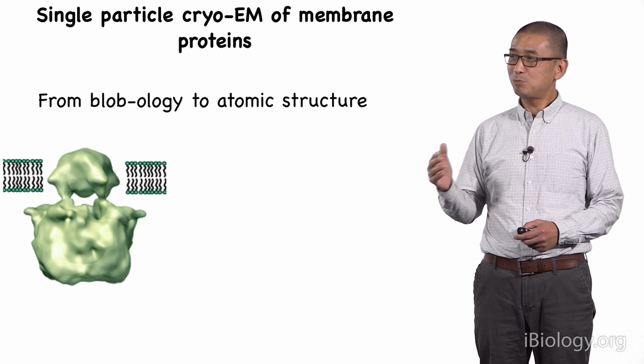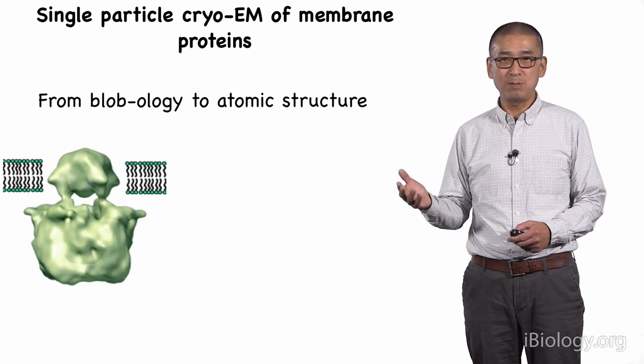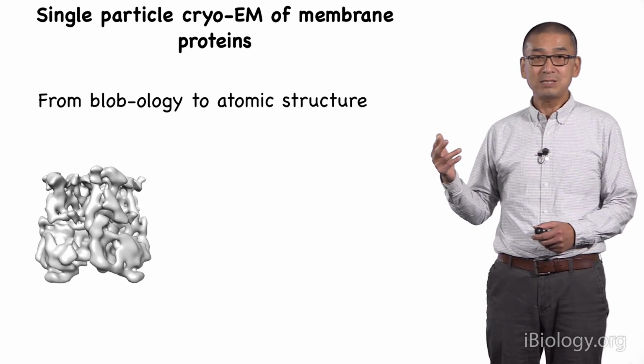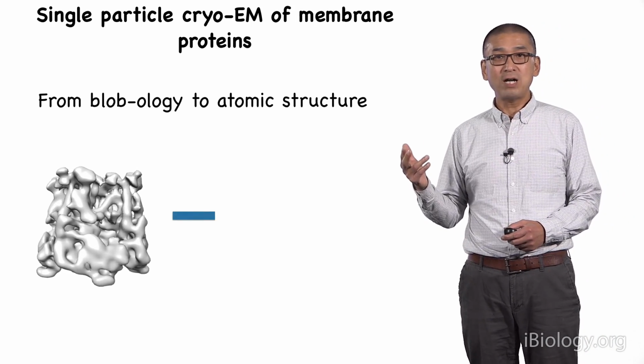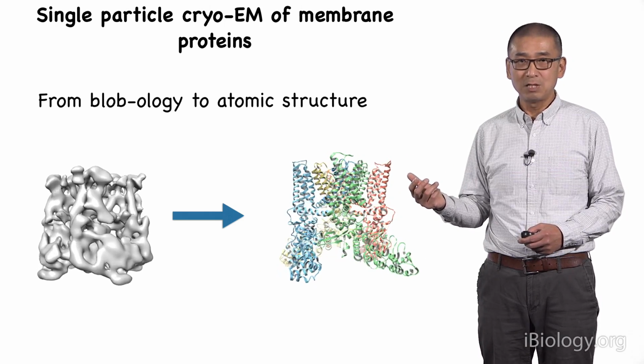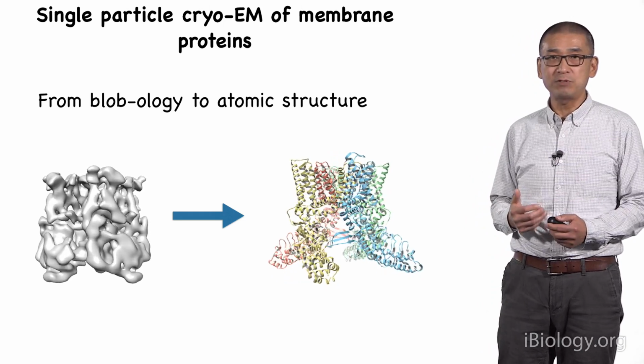We try to bring something that looks like this, which shows a blob of a molecule, to something like this one, which has secondary structure features, and finally to something that looks like this, which has atomic details. So this is our overall goal, our overall mission of the lab.